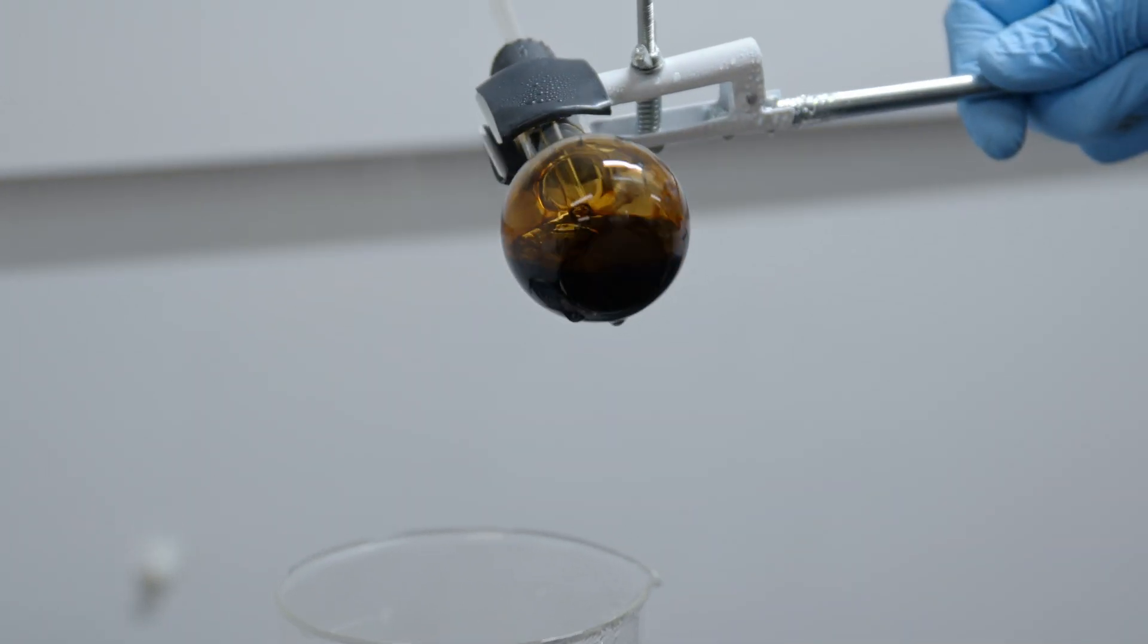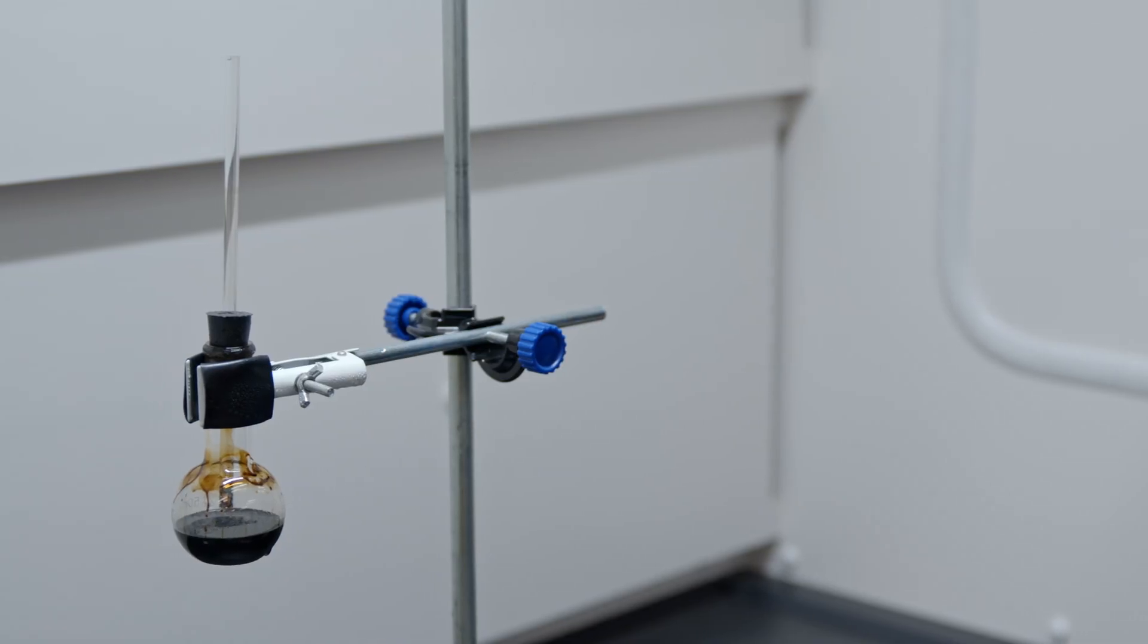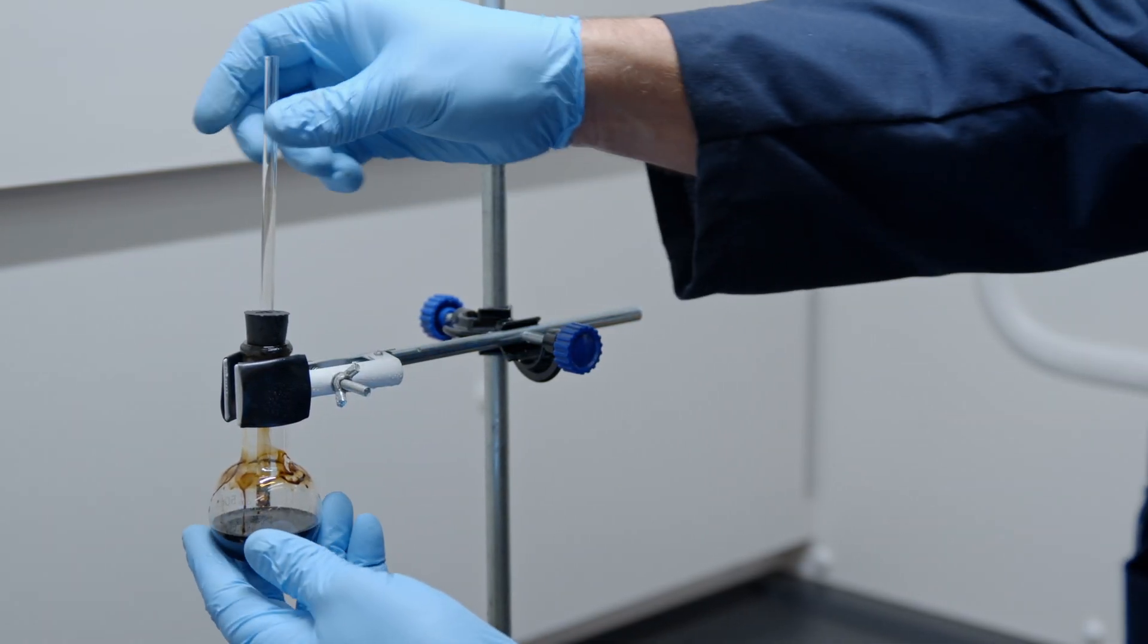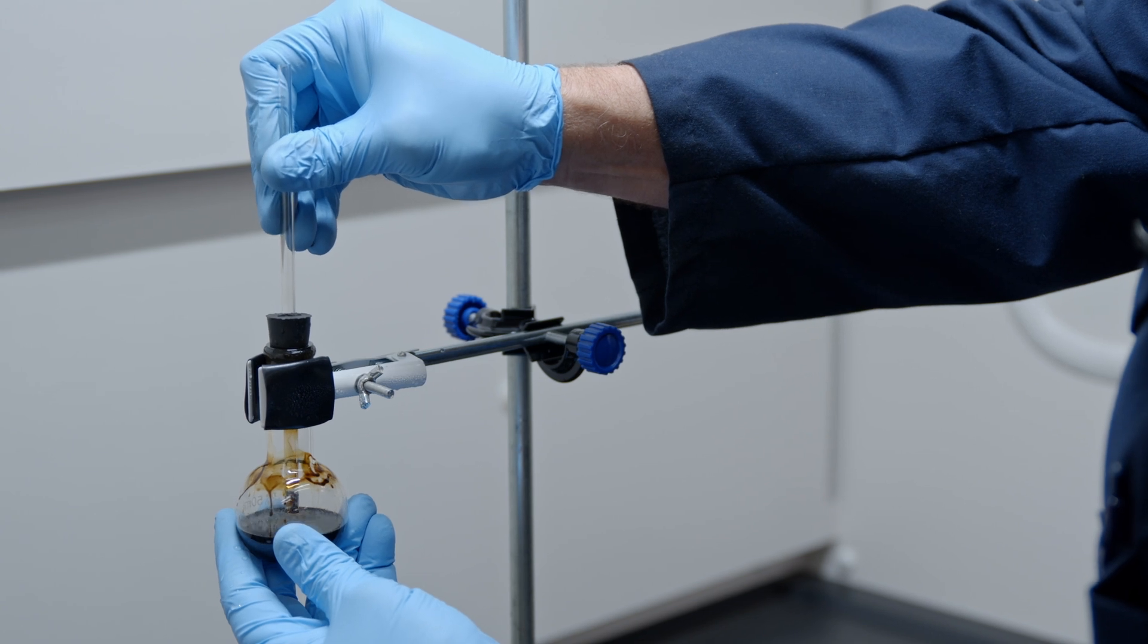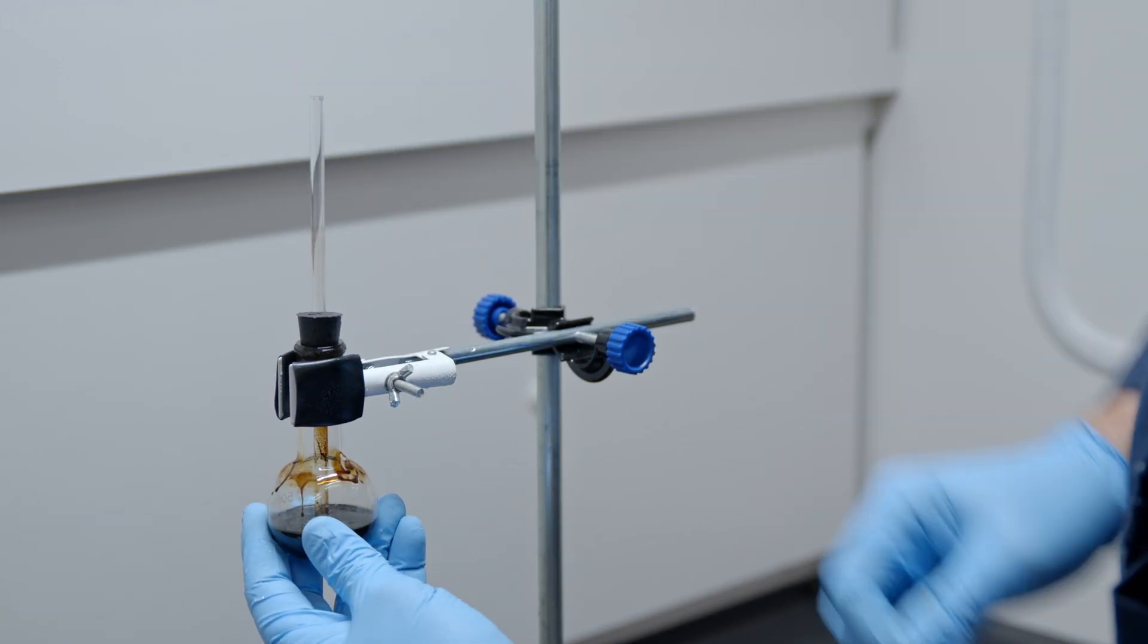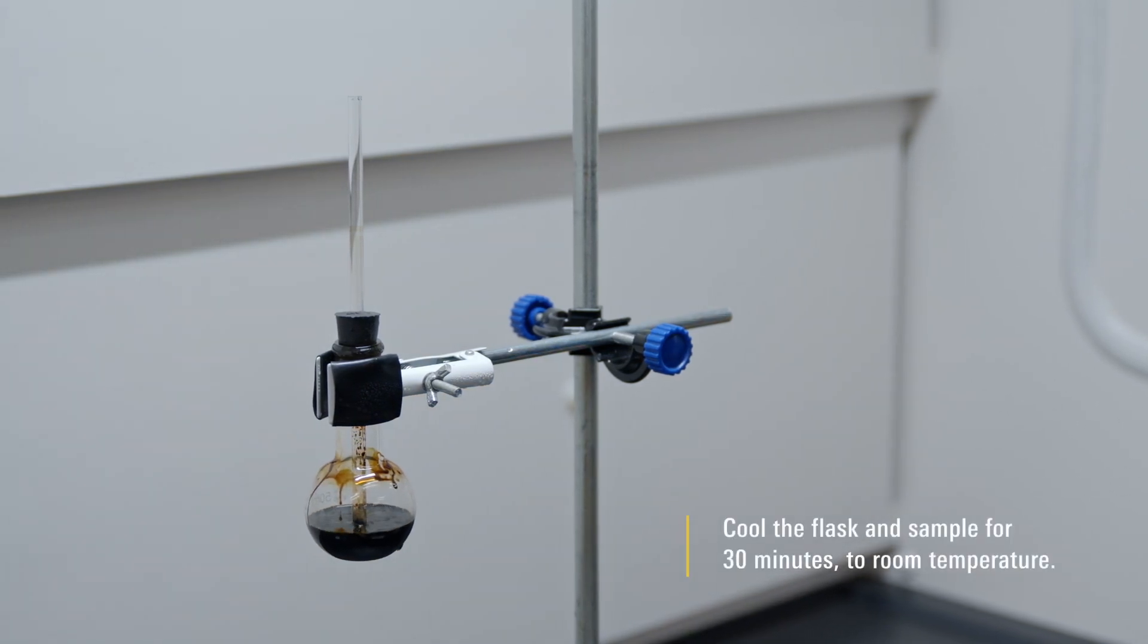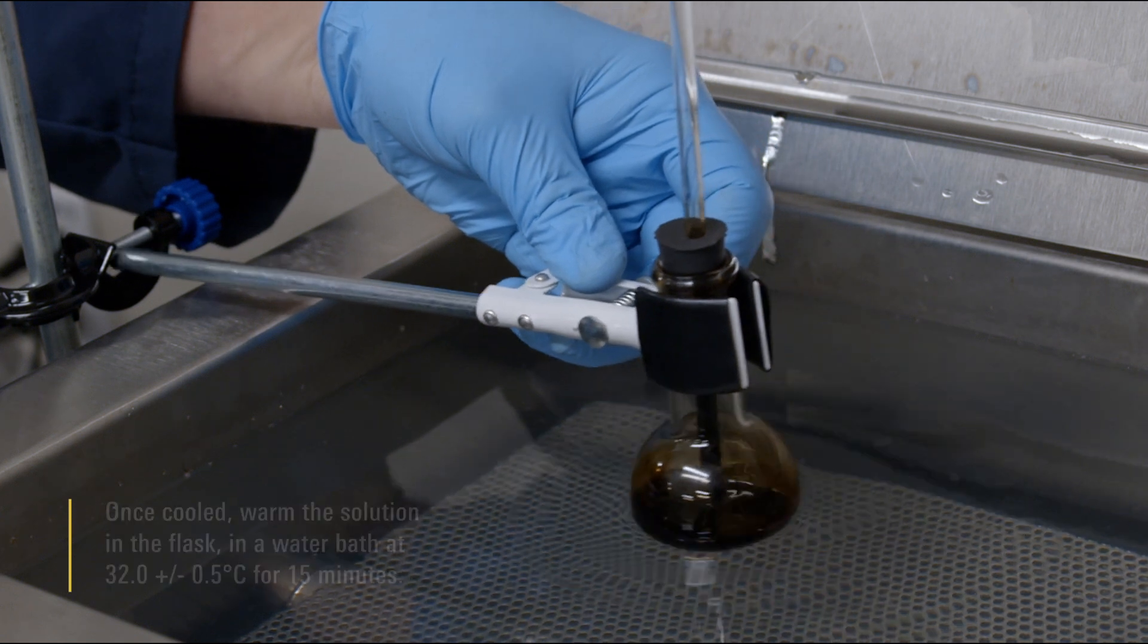Tilt the flask periodically to determine if the sample is fully dissolved. When the sample is fully dissolved, discontinue the boiling and swirling process. Lower the end of the glass tube below the level of the solution in the flask. Cool the flask and sample for 30 minutes to room temperature.